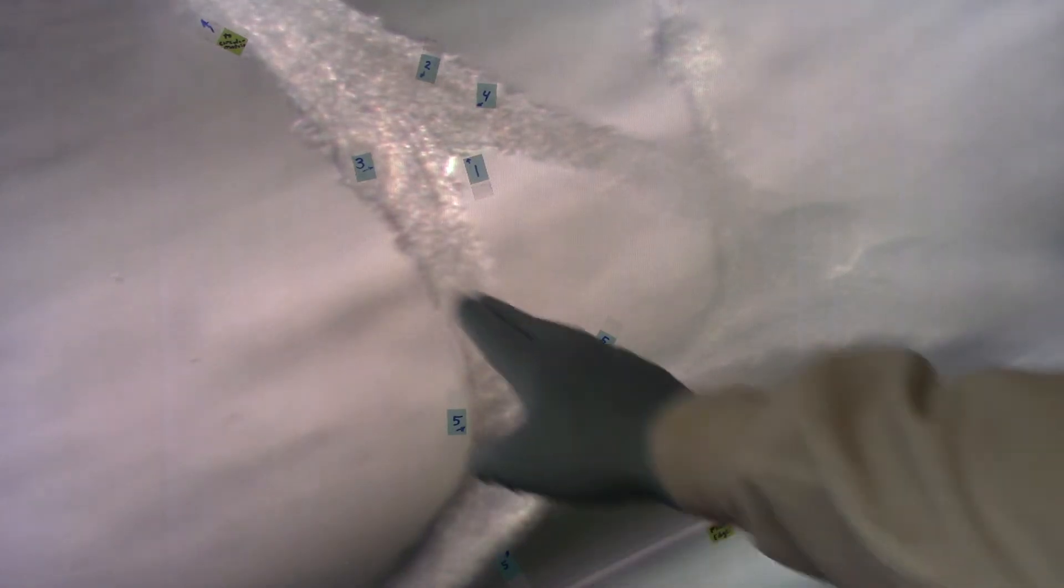These are mouse p19 pl6 cells on a fibrin matrix in a six-well dish. This is the edge of the dish and this is towards the interior of the dish where there's a large circular fibrinogen matrix.